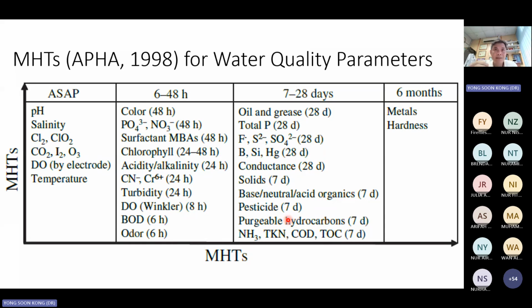It's not that the metal can evaporate. It won't turn into gas. It will stay inside the liquid. But do you still remember from last week, how do we preserve the water sample? Let's say you just want to know the metal content and the metal is stable inside the water sample.